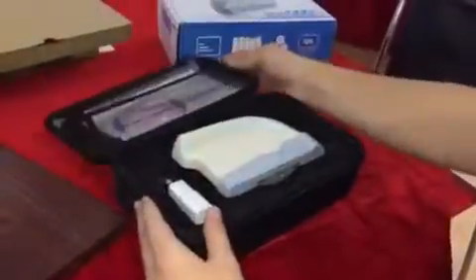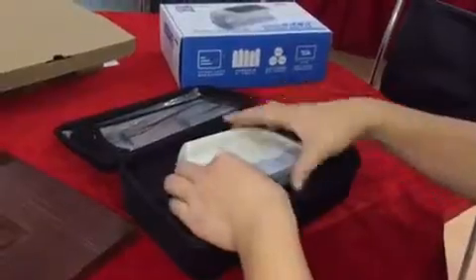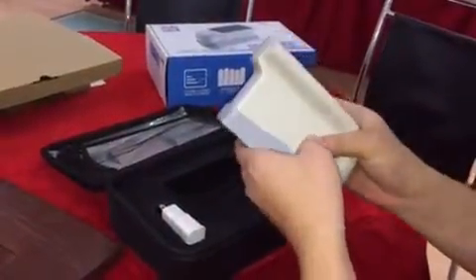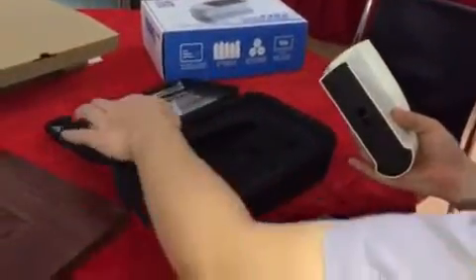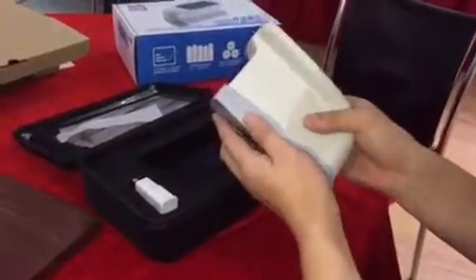First, open the case, take out the glassmeter, and take off the calibration board. Take out the protecting paper, then put the calibration board back with the glassmeter.